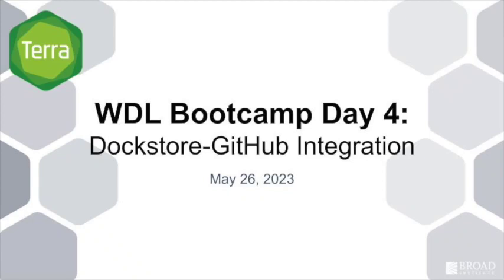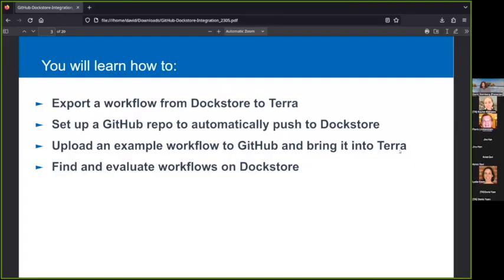Today, we're going to talk about Dockstore, which we mentioned briefly previously. I'm a developer at Dockstore. My name is David Steinberg. And we'll export a workflow from Dockstore to Terra.